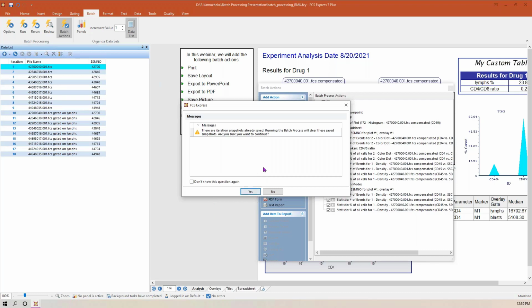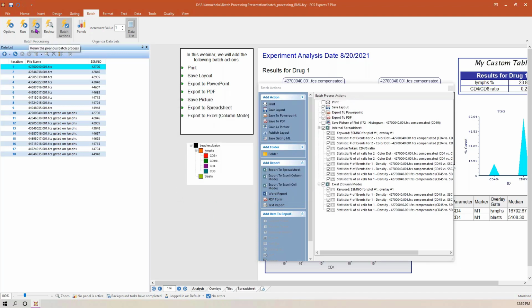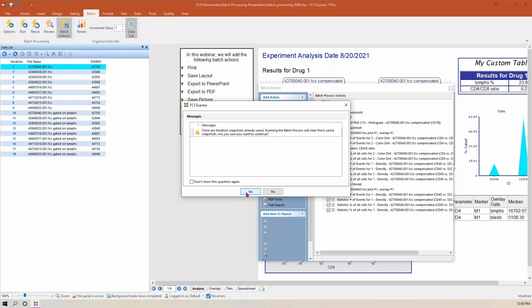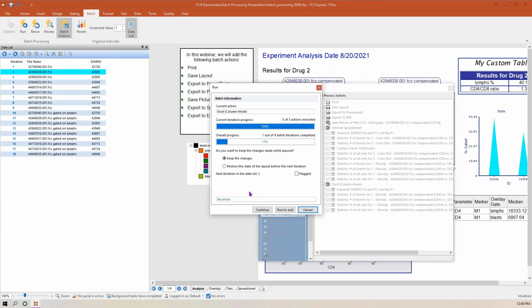Now, if you click yes, it's going to go forward. If you click no here, then you're going to be able to maybe check off rerun or whatever else it is that you need to adjust here. So we're okay to just run this as is. So I'm going to go ahead and click yes. Then we have this nice little update window, right?